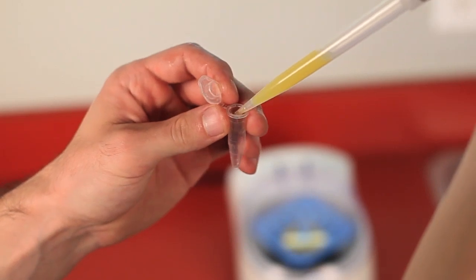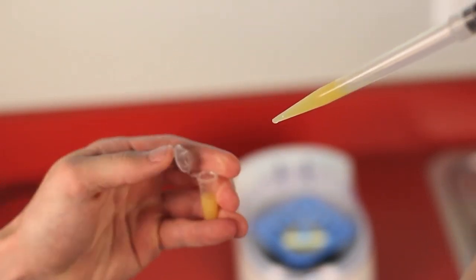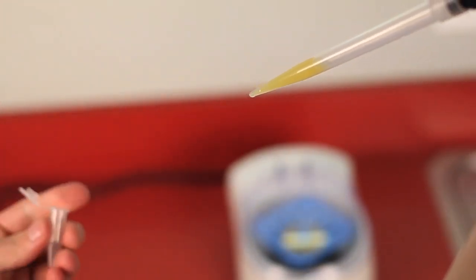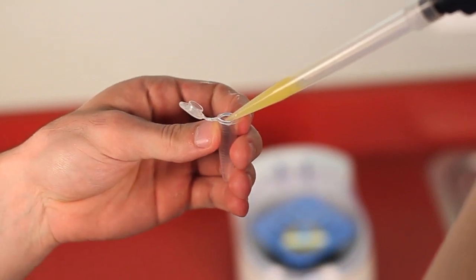Step 2. Make sure your microtubes all have equal amounts of substance, including your balance tubes. It is also important that your balance tube contains liquid of equal density, especially when dealing with larger test tubes.